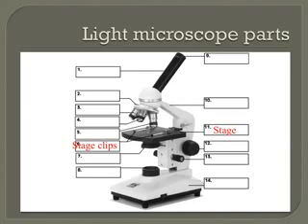You should secure your slide on the microscope using stage clips. They will keep the slide in place, preventing it from moving around too much when you don't want it to. While held down by the stage clips, you should be able to manipulate the slides carefully so that you can find whatever it is you're looking for.